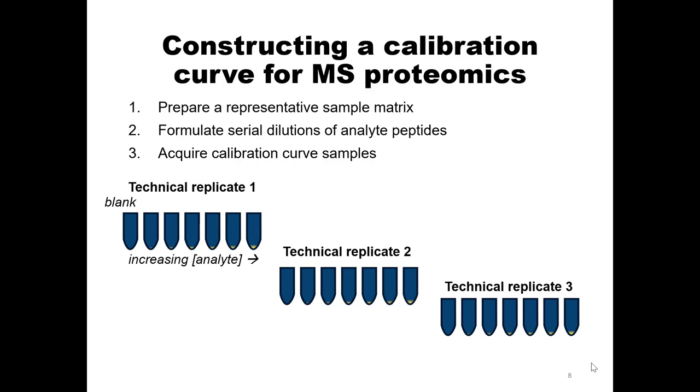So we generated a 16-point curve that we had some selected sites carry out in triplicate or quadruplicate. So 16 concentrations, 1 blank. And from those data points, we were able to figure out a curve with lesser concentrations.